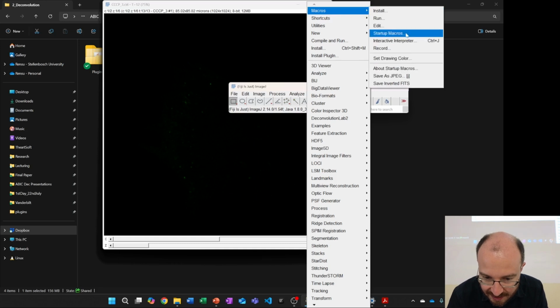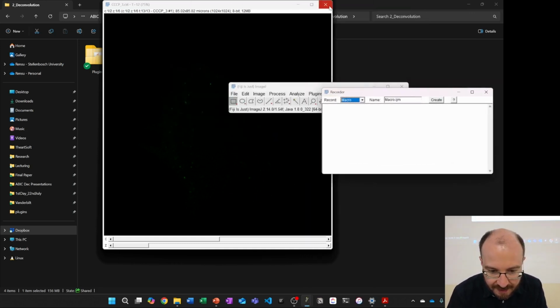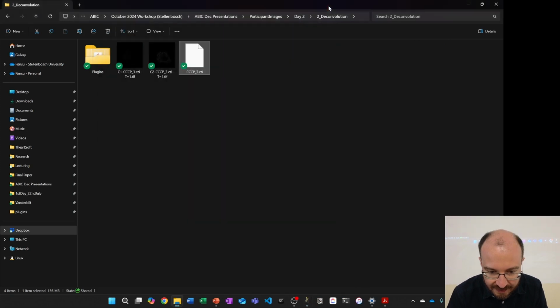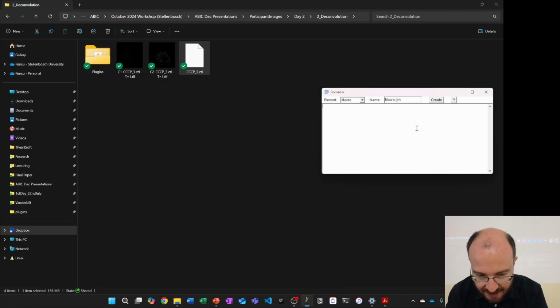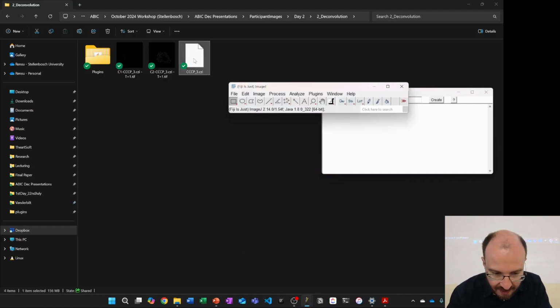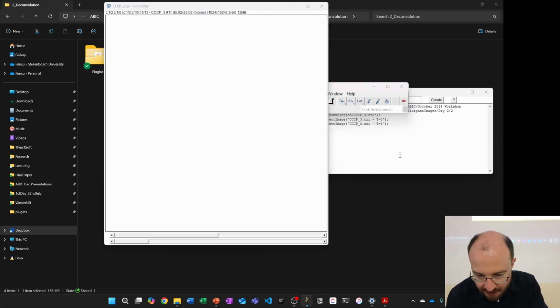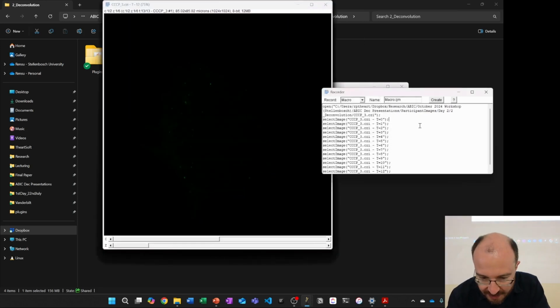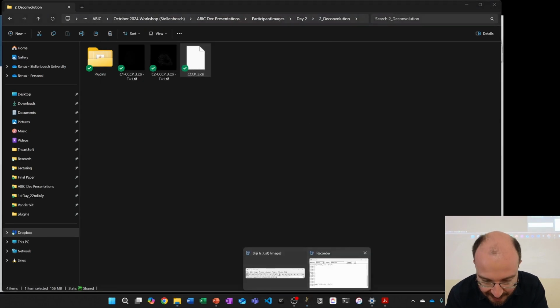Let's just say, where's the record macro? There you go. Sorry, I am now doing things a little bit out of the order that I was imagining I would. Okay, importing the image, say split time points, and yeah, let me just leave that for now. You can see by doing that, there is this. This is not the right one. Oh man, sorry guys. Let me just show you the one that's more helpful for the macro.